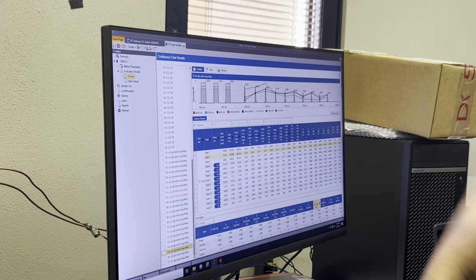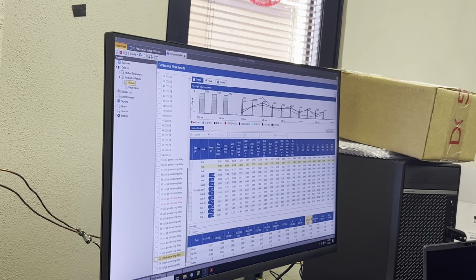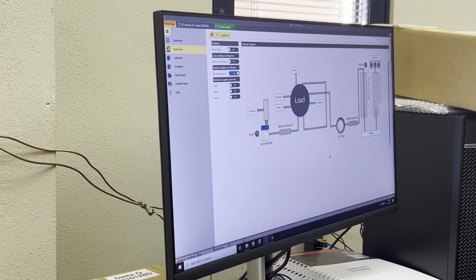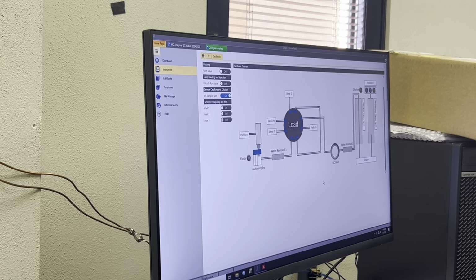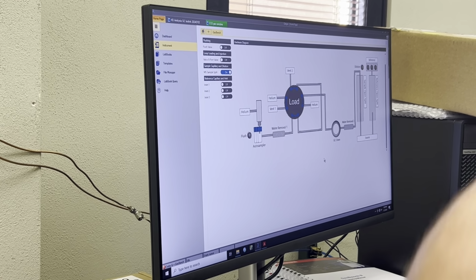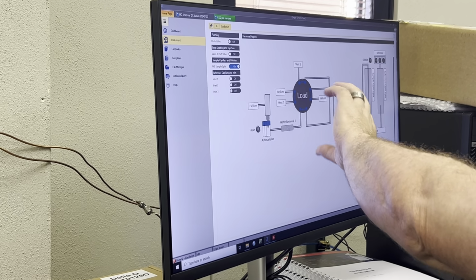In the loading mode, are you just accepting some loss of sample as it vents through vent 2? Yes, you are going to lose some sample. It's flowing at a specific rate, so you're going to get a mixture of your CO2 and your helium.